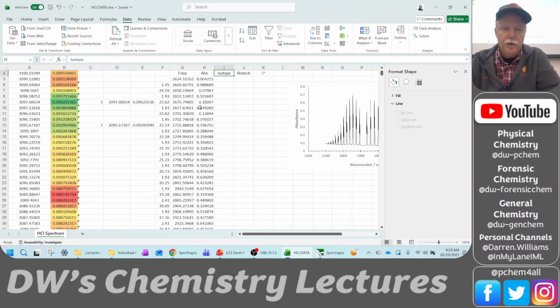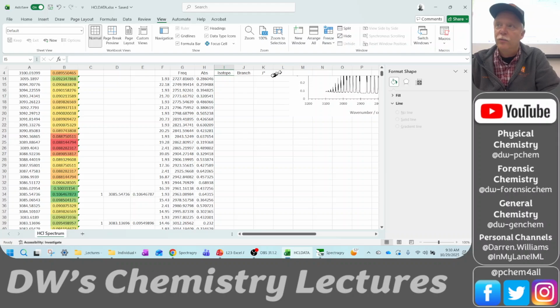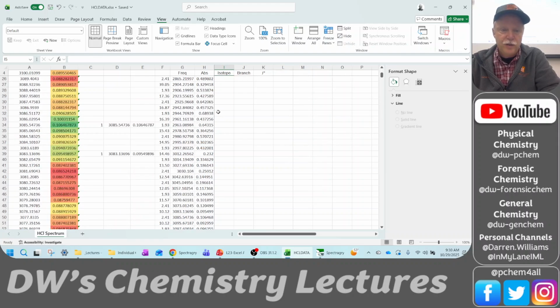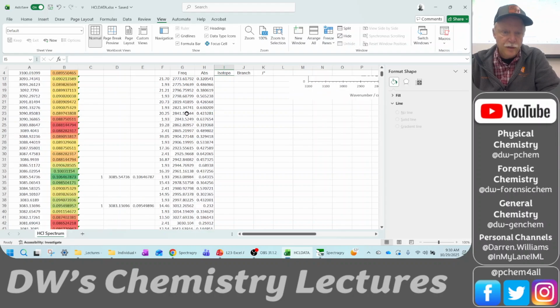Second, let me go up here and I'm going to do freeze frames. Do y'all know about freezing the panes? So I'm going to freeze these panes right here, freeze panes, so that when I scroll down, you see the isotope and branch stay put. So I'm going to scroll down here to 2904, 2906, that range.